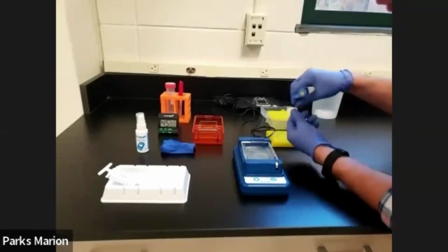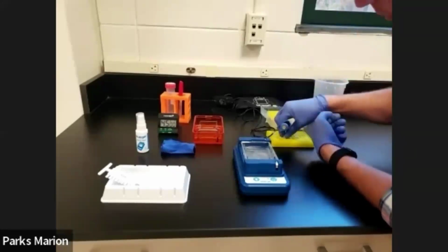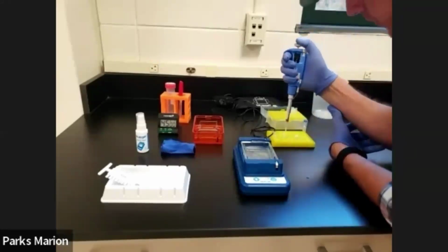Then we'll move on to our positive control, where we'll do 2 wells with the positive control.